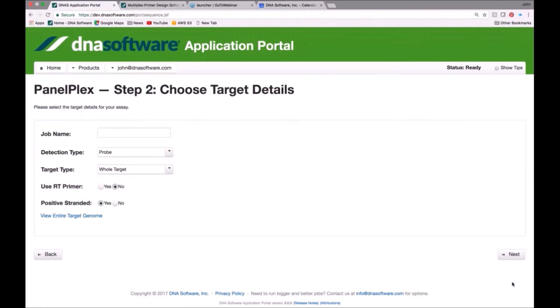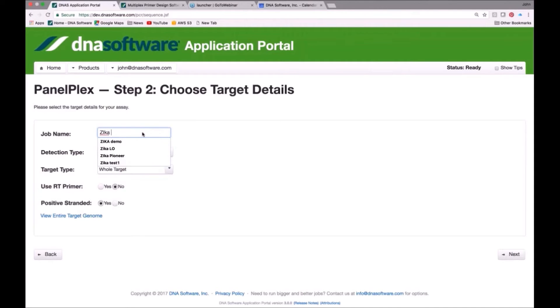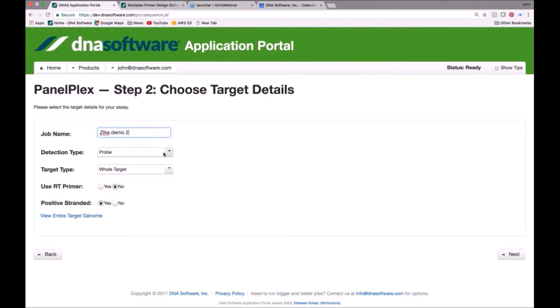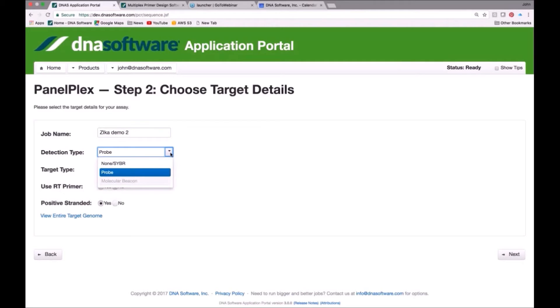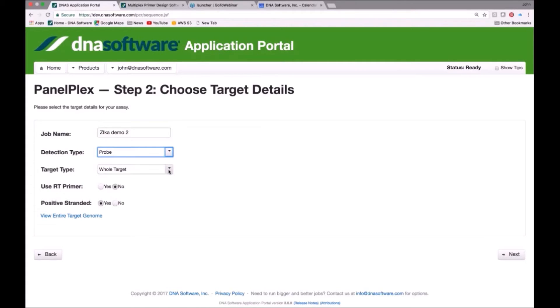Here we are on the target details page. We need to give this job a name. I'm going to call it ZikaDemo2. That's the name of my job. Lastly, we're going to choose what type of detection we want to use. If this was an NGS application, we would choose no probes, because you just want to amplify the target. If we want to detect them with a fluorescent probe like a Pac-Man probe, we choose probe here.